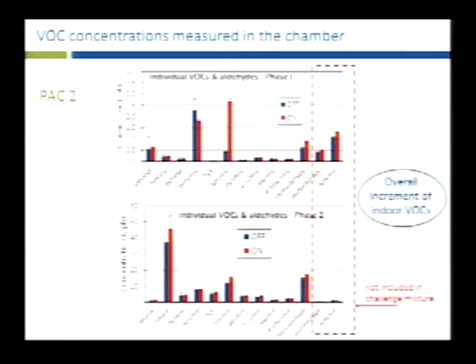It's not a lot. But during the initial burnout period, we didn't just take the air cleaner out of the box and install it in the chamber. In each case, we had a fairly long burnout period during which we monitored it and verified that those initial emissions that sometimes take place were already accounted for, and we didn't want our results to be confounded by that. So this toluene is what's left after a much larger plume was produced in this particular air cleaner initially.